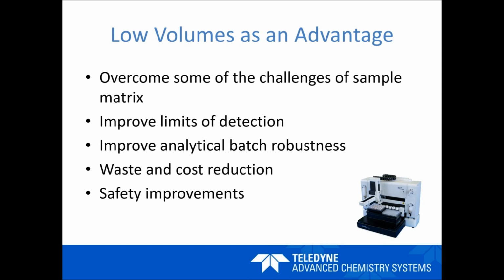So actively going to lower volume and lower flow rates, it would appear that there are benefits in terms of greater processing power from the plasma, less disturbance to the plasma as your sample's going through. And we've certainly seen for certain sample types improvements in limits of detection. So a good example for you is in a xylene-based matrix for some oils analysis.